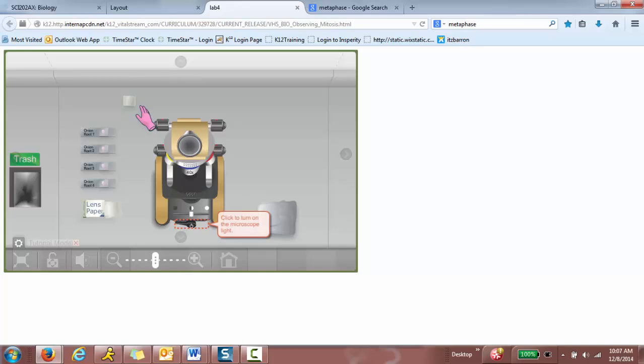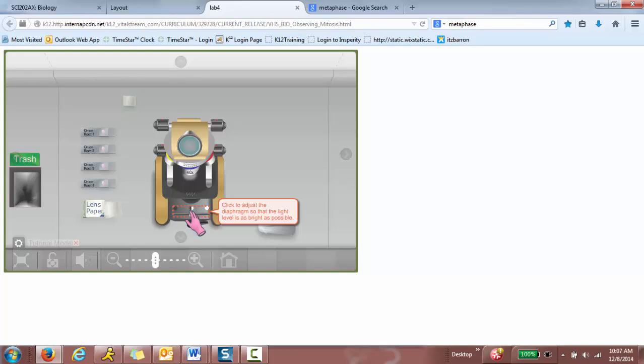Click to turn on the microscope light. So it's this black button on the bottom. Click to adjust the diaphragm so that the light level is as bright as possible. And it has to be pointing like this.